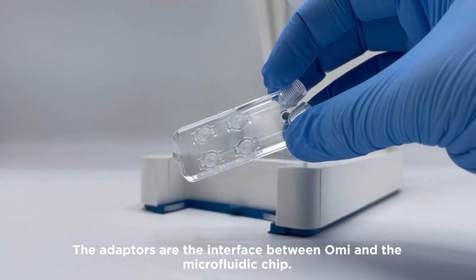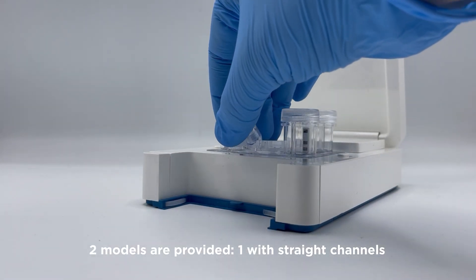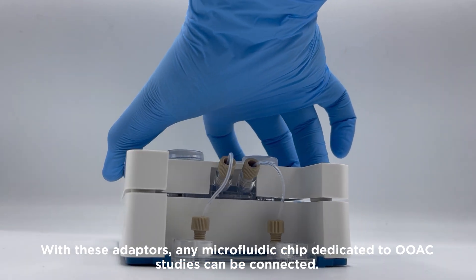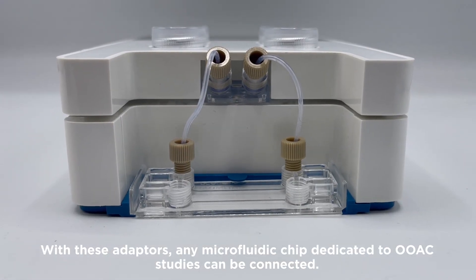The adapters are the interface between OMI and the microfluidic chip. Two models are provided: one with straight channels, and one with more complex channels that provide a high resistance. With these adapters, any microfluidic chip dedicated to organ-on-a-chip studies can be connected.